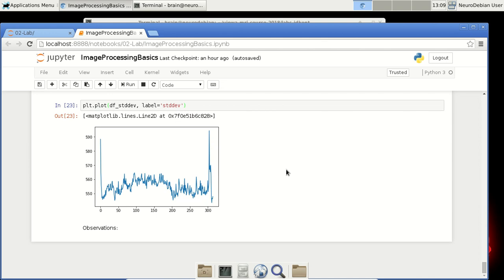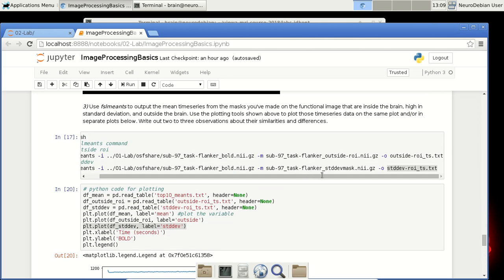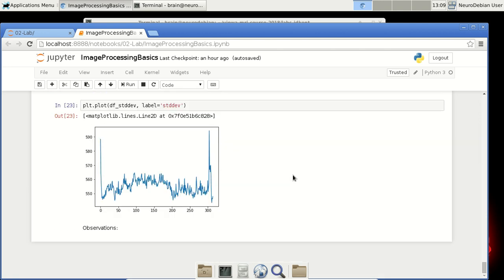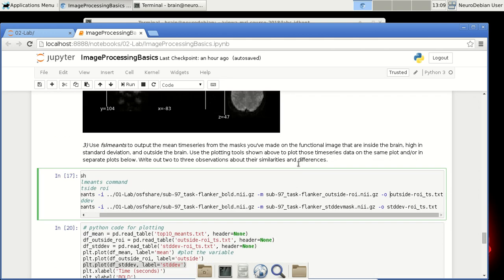I think part of the takeaways from this is going to be naming your outputs consistently and giving yourself a nice working directory. It makes it cleaner to understand where your files are, what you named them, and avoids situations in which you overwrite your file names with something else.